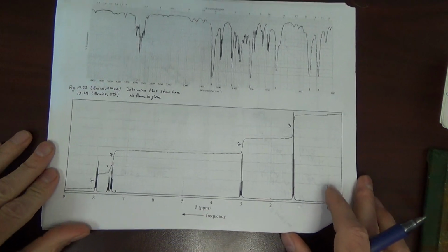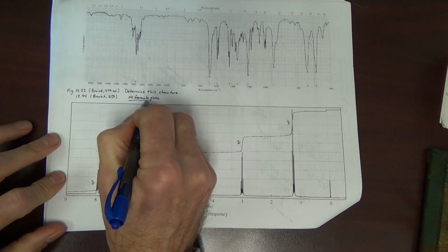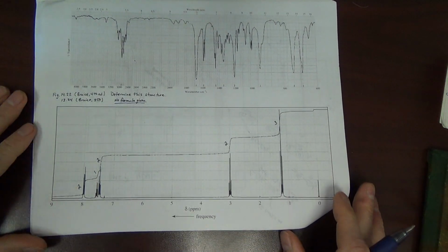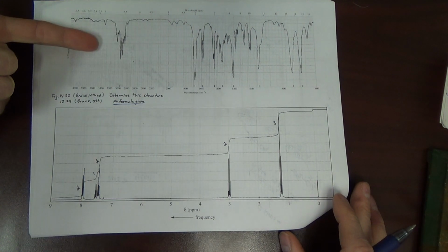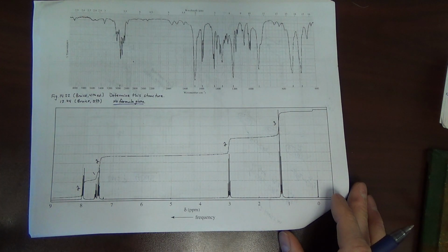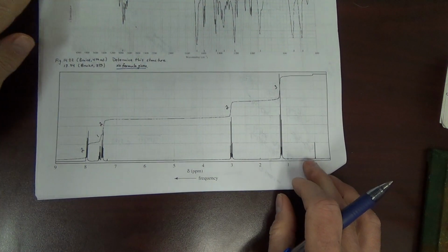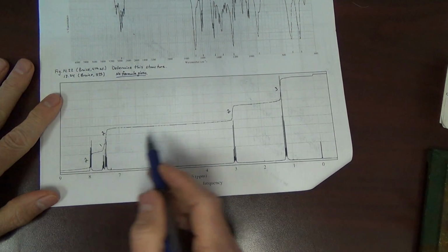On the flip side here, no formula is given for this compound. But we do have an IR. Now, someone has done a little work for you and given you integration already.